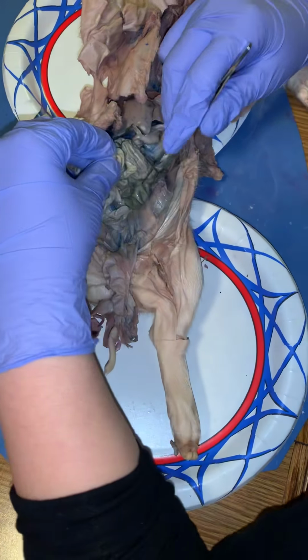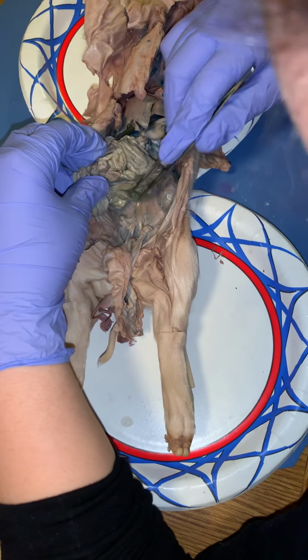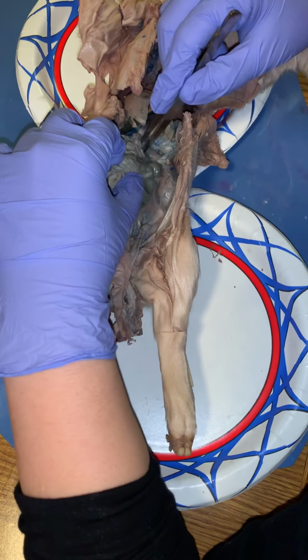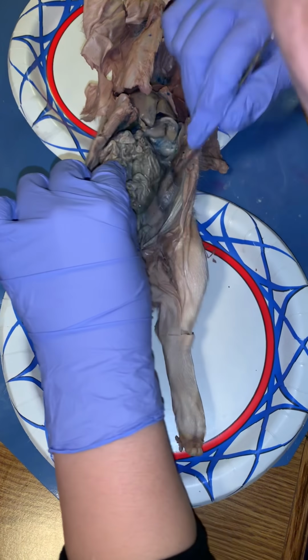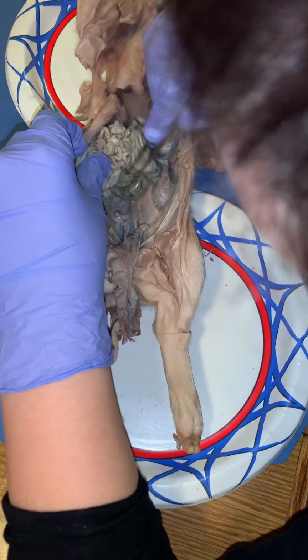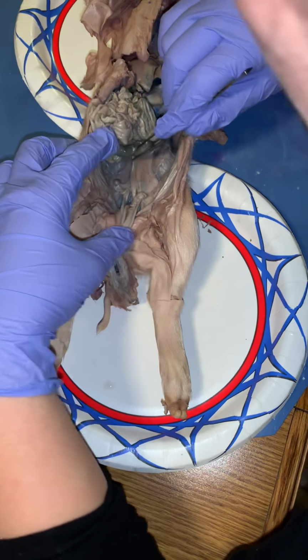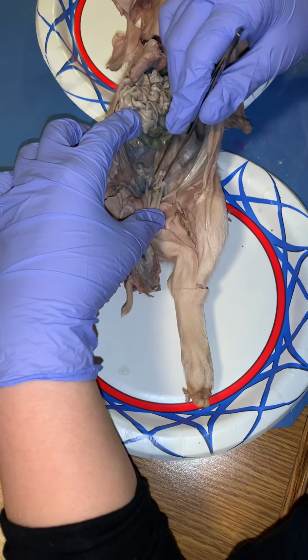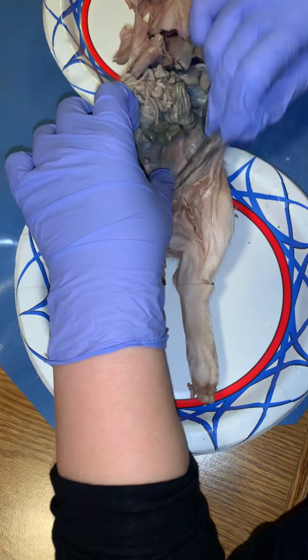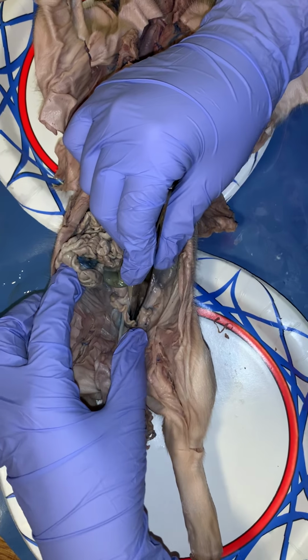So the rectum is found right here. This is the large intestine, kind of runs around right here, connects to the small intestine. So the rectum, and then the anus, actually, here's the rectum following it down, empties into the posterior side of the pig. You can see right here. I know it may be difficult to see.